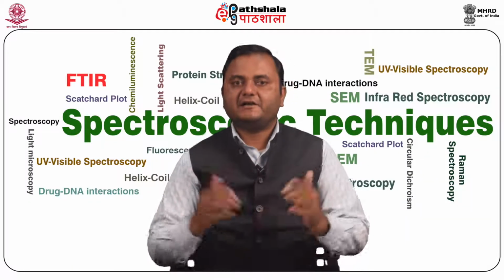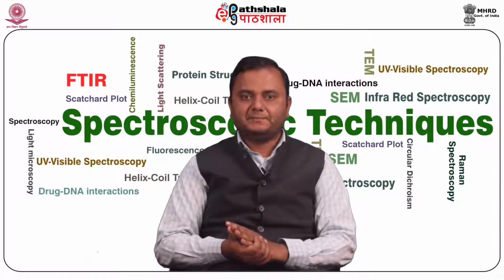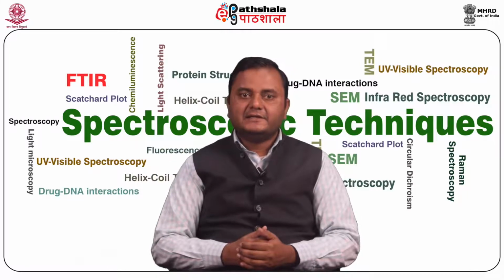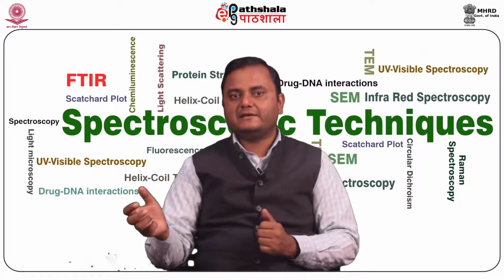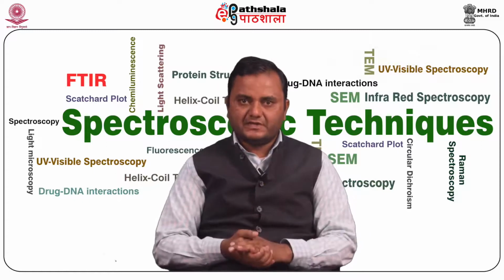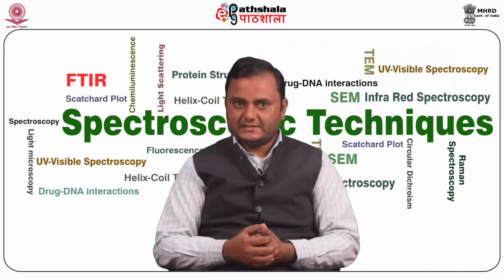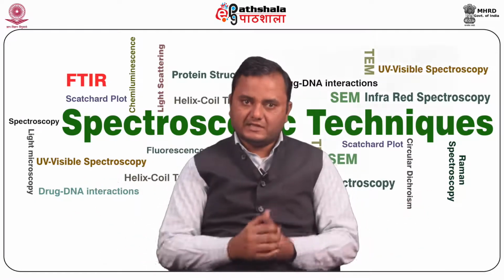Let's talk about the advantages of FTIR. The first advantage is the Fellgett, or multiplex, advantage. That is the advantage of having a high signal to noise ratio as compared to the dispersive instrument. The FTIR collects all resolution elements with a complete scan of the interferometer, and the successive scans of the FTIR instrument are coded and averaged to enhance the signal to noise ratio of the spectrum. As the number of scans increases, the signal to noise ratio increases, and the data quality is enhanced very well.